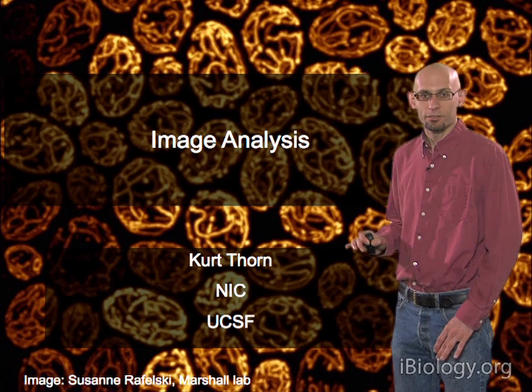Ideally, if you're doing image analysis, particularly quantitative image analysis, you'd like 0 to be meaningful, in the sense that 0 reflects what you see when there's no real fluorescence from your sample. So if there's no fluorescent protein in your sample or no antibody staining, you'd read 0 and not 200 or 1,000 or whatever. Generally the way you deal with this is background subtraction. You try to measure or estimate your background in your image somehow, and then you subtract that off.